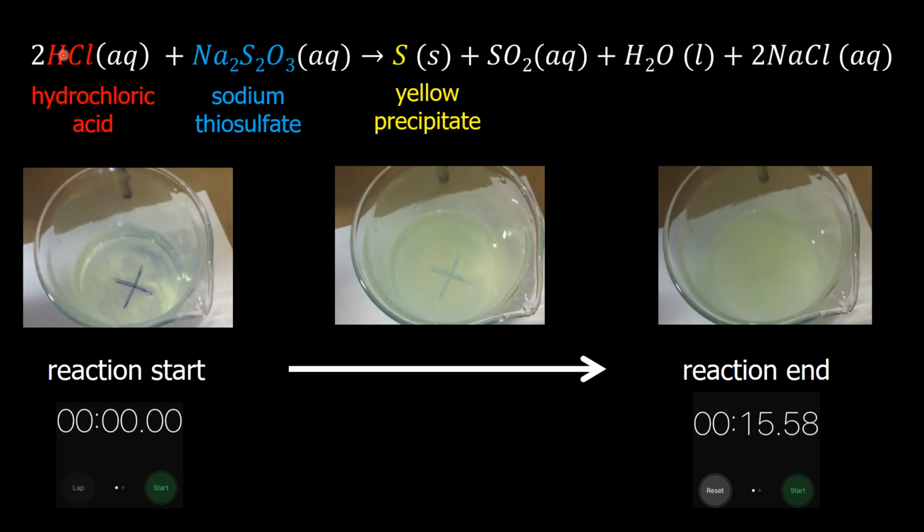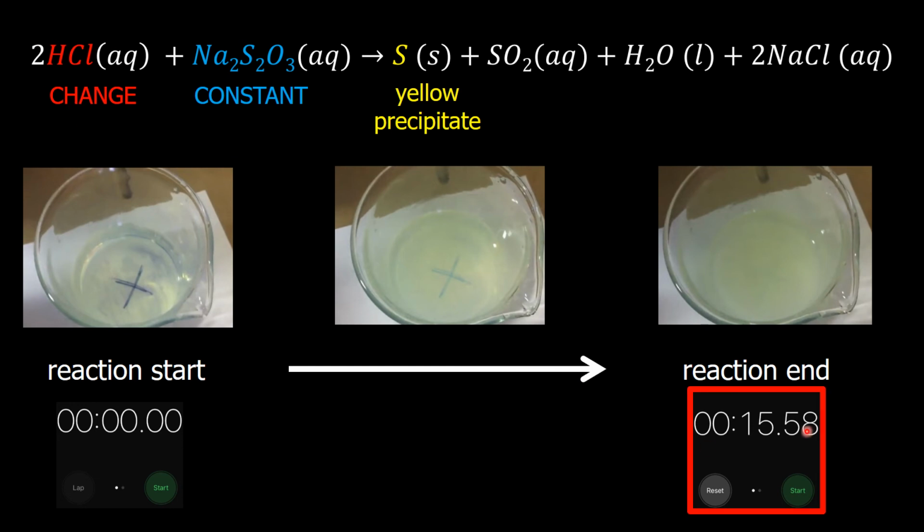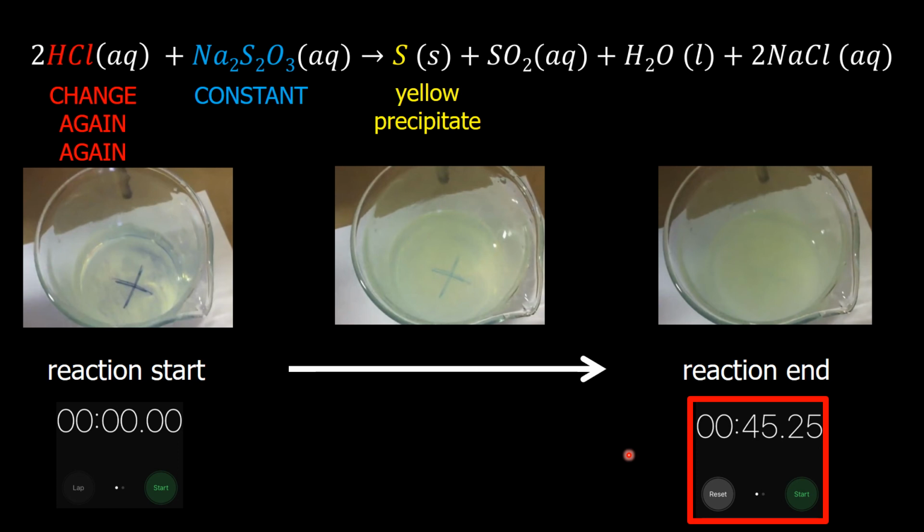Now, in order to see how each reactant affects the rate of the reaction, what we have to do is carry out some controlled reactions. So what I mean by that is we have to carry out a series of reactions where the amount of the hydrochloric acid changes, the amount of the sodium thiosulfate stays the same, and that way we can see specifically how changing the amount of hydrochloric acid affects the rate at which the reaction occurs, how much time it takes for the reaction to occur. So we'll do that, change it once, measure the time, change it again, measure the corresponding time again, and then one more time, measure the corresponding time.